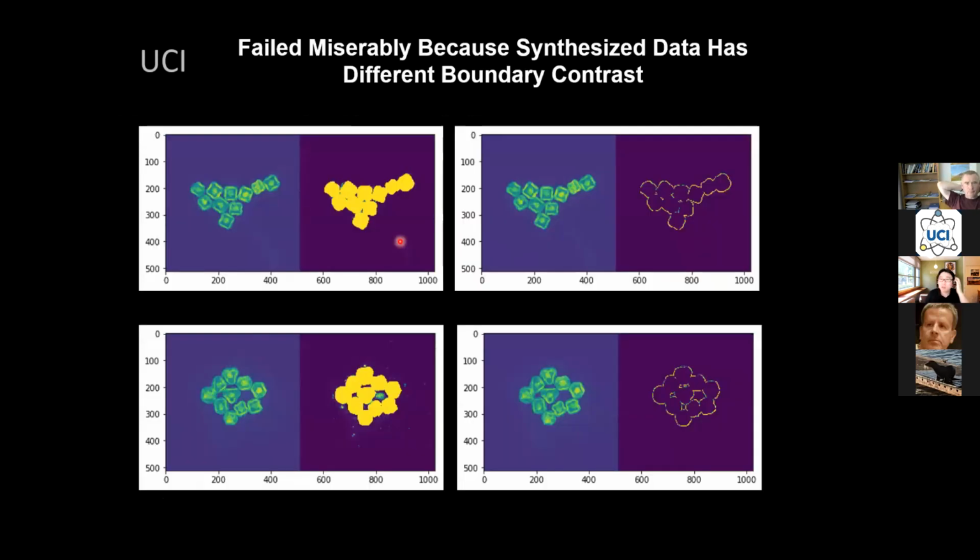And here's after training. And then you apply it to the real experimental images, and you find, okay, it fails miserably. They don't get segmented separately, right? You see all of these particles here, they're connected. You want them to be disconnected, right? So this is not doing me any favor.